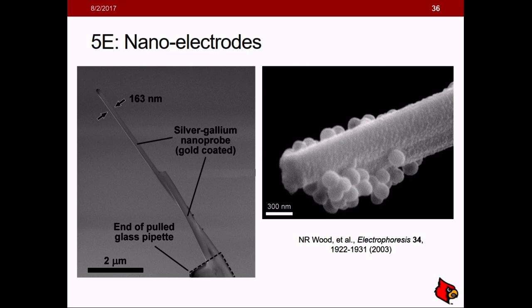So one way of doing it is, yes, you can crank up the voltage. You can do that, but that is not extremely feasible for various applications. Usually bad things happen when you increase the voltage. You may also have limitations in terms of the amplifiers that are available for the frequencies that you want.